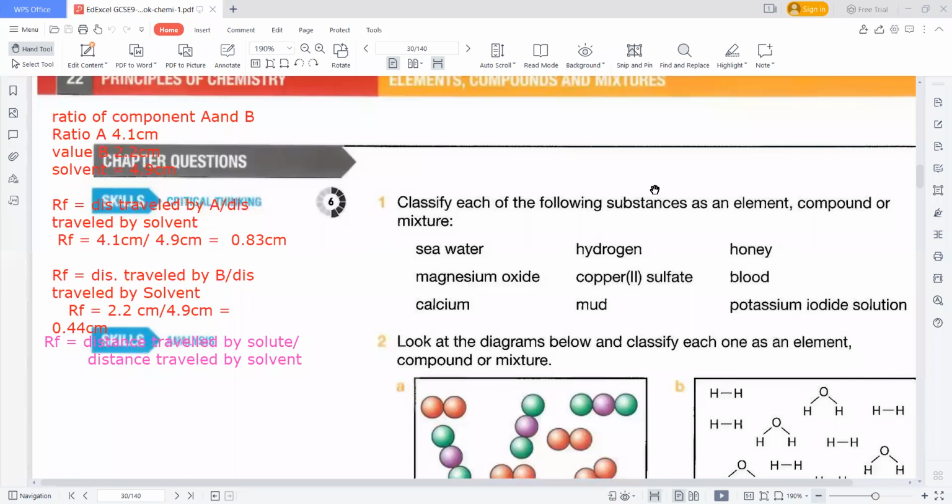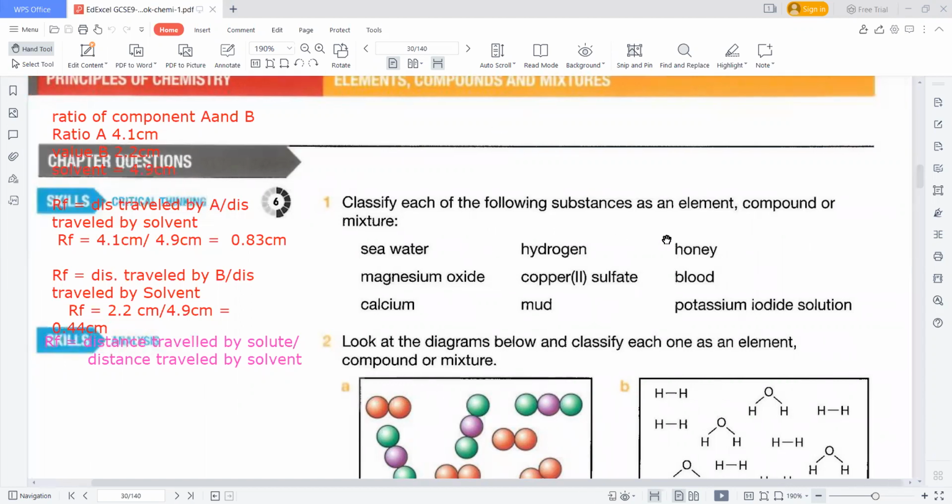Today we covered chromatography, and at the end we learned about the RF value. With it we can compare the distance covered by samples to the distance covered by solvent. By looking at these values, the one whose RF value is lesser has covered the least distance. Okay, so that's it.